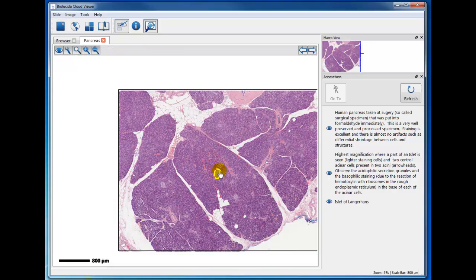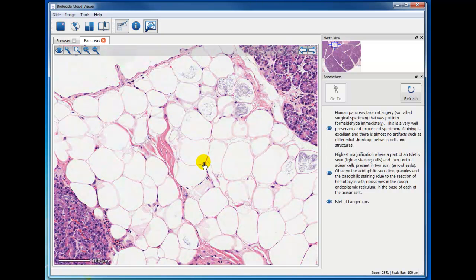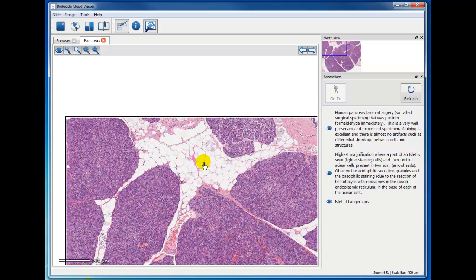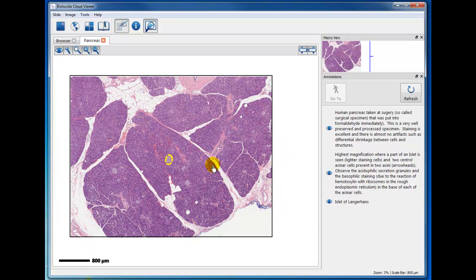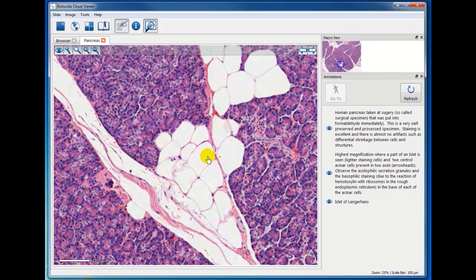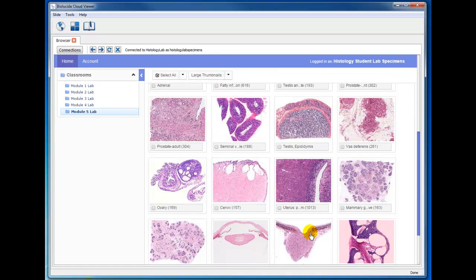But you see on this one, the adipose tissue is actually outside the tissue of the pancreas, so that's just filling in between the lobules. But in the other specimen, it actually had infiltrated the gland. Actually, this is the beginning of that kind of infiltration. I'm not sure why the adipose tissue infiltrates, and I doubt if anybody really can explain that, but it is a fact.